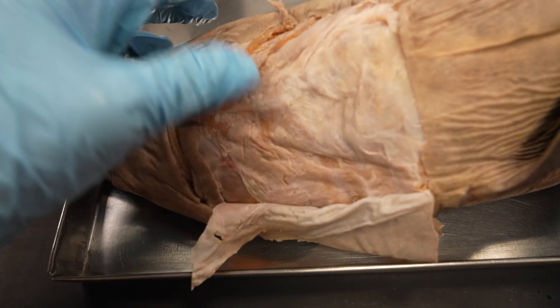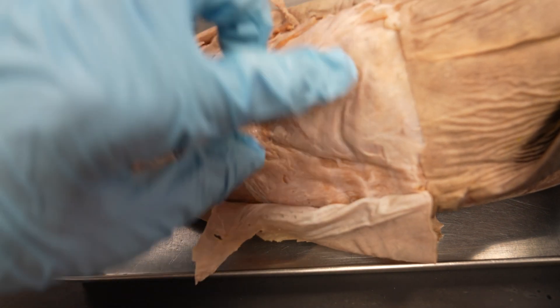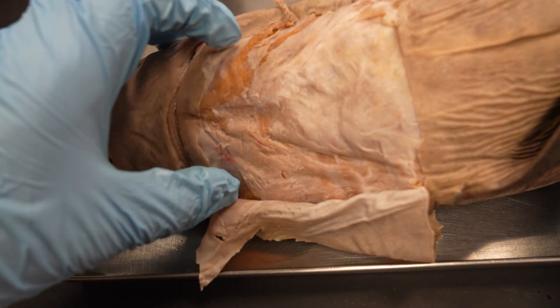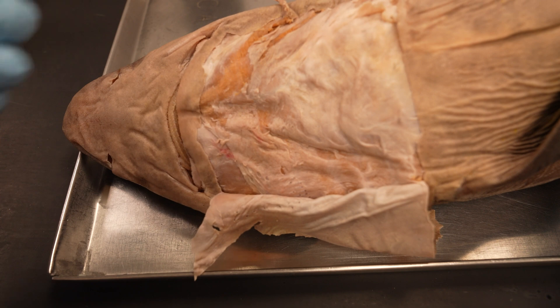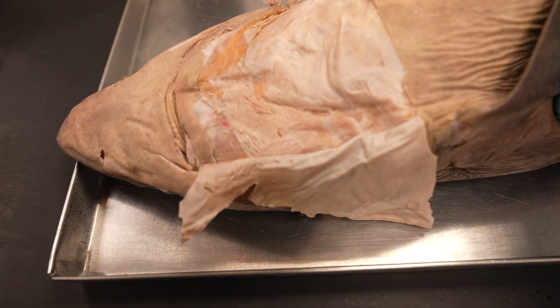All right, so we removed that skin. There's still a lot of tough fascia down here, so we'll want to clear some of that away so we can see the underlying muscles. Then we're going to get underneath the intermandibularis and make a cut so we can see the deep muscles. So let's work on clearing some of that fascia and then I'll come back.